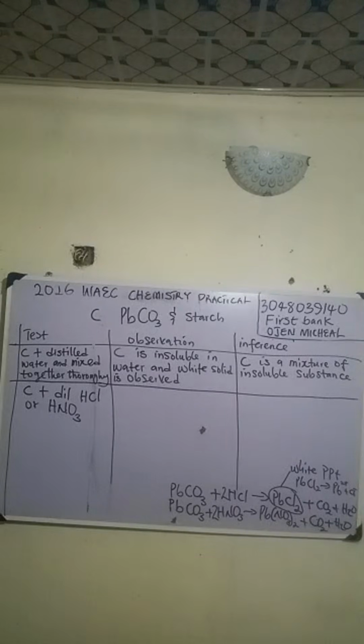Can we proceed? I have given you two options. It is either they will give you HCl or HNO3. Which one will dissolve? HCl will not dissolve.